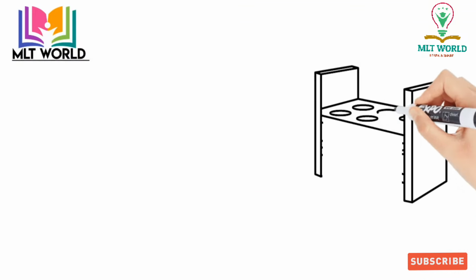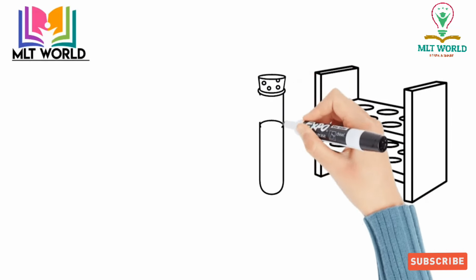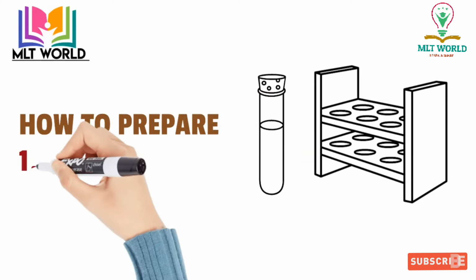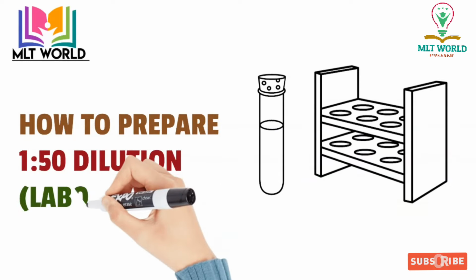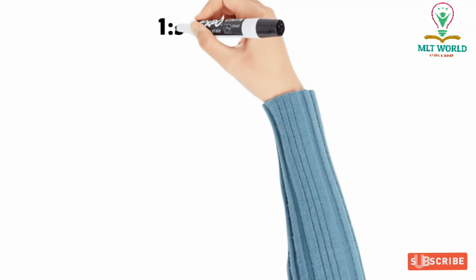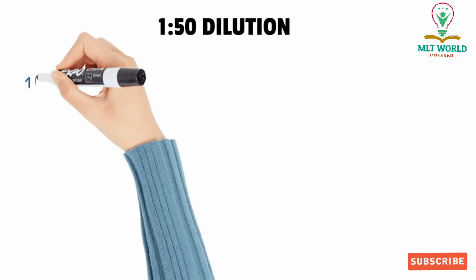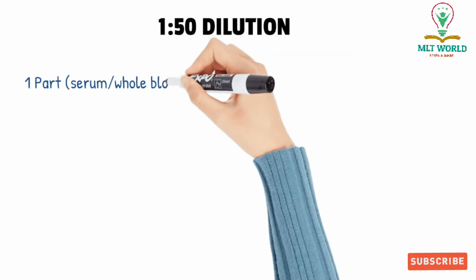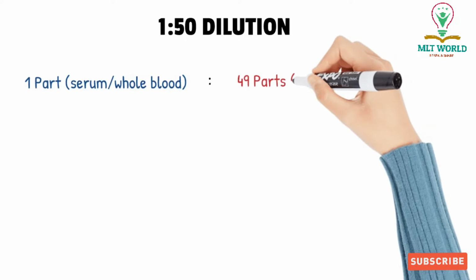Today in this video I will share with you how to make a 1:50 dilution in the laboratory. In the last video I showed you a 1:20 dilution, but in this video we will learn about the 1:50 dilution. For example, if any value is coming very high and the machine cannot show you the exact value, it is coming, for example, more than 1500, but how much more than 1500? That time we will dilute the sample.